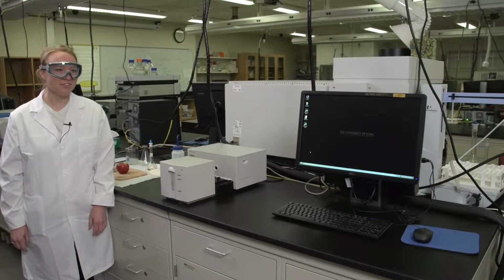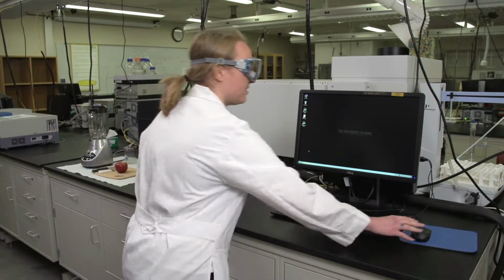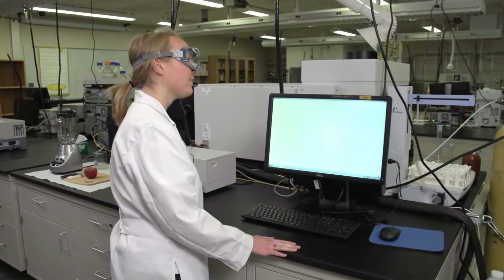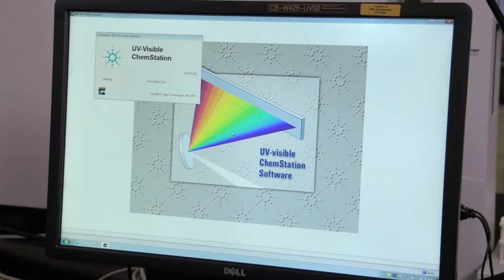When you get to lab, the first thing you should do is turn on the UV vis spectrometer. Then you'll want to go over to the computer and turn on the instrument online software. When the dialog box prompting the operator name and password comes up, you can click Cancel and wait for the software to load.